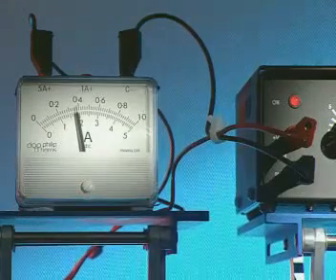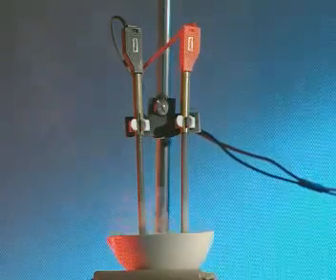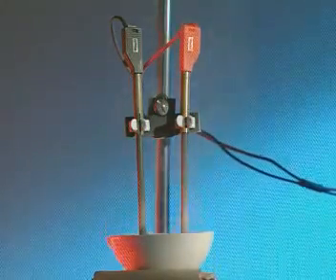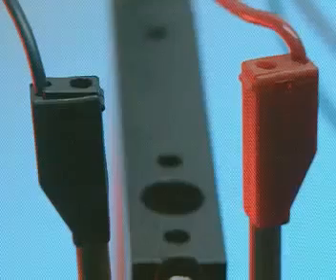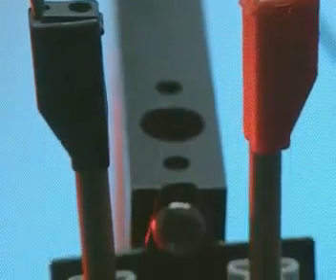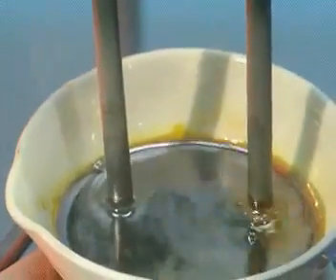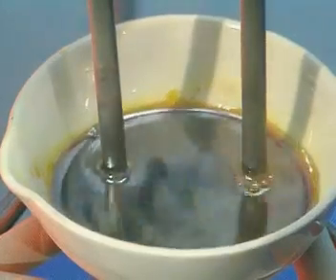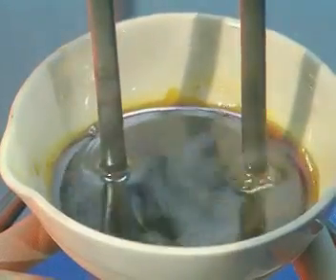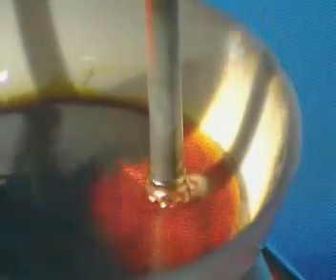Switch on now and a current flows. In this circuit, the electrode on the right is positive, the one on the left is negative. As electricity passes through the molten lead bromide, chemical reactions start. On the left, at the negative electrode, nothing appears to be happening. But at the positive, bubbles mean a gas is being produced.